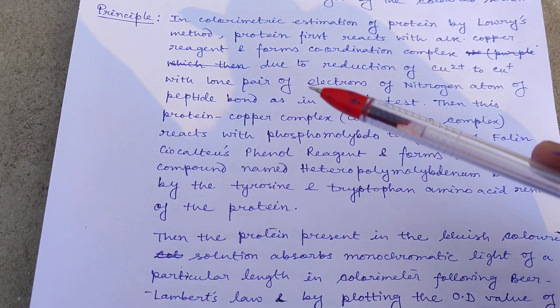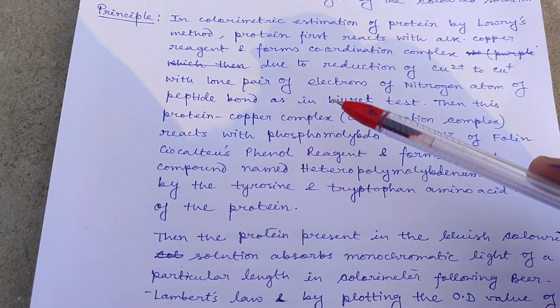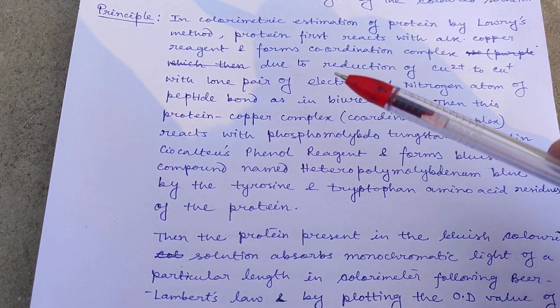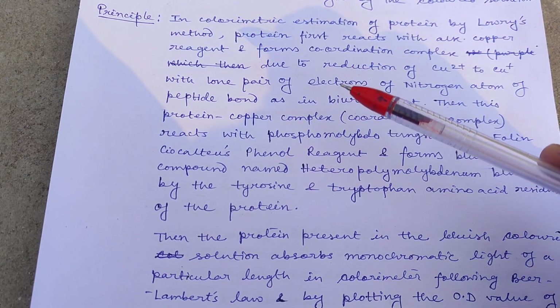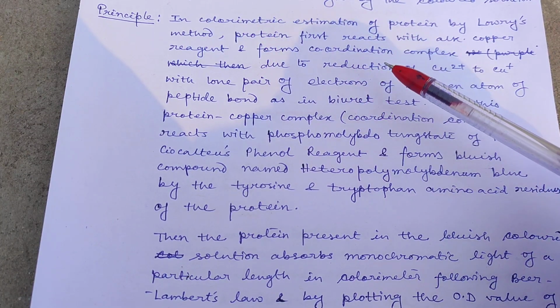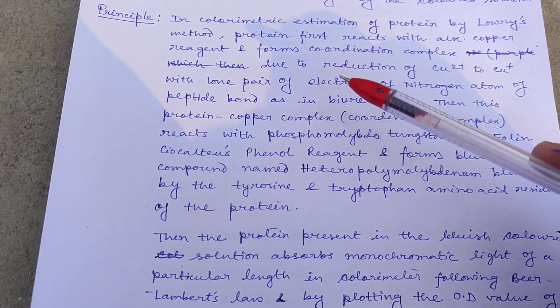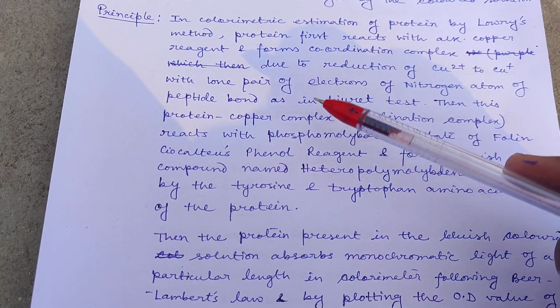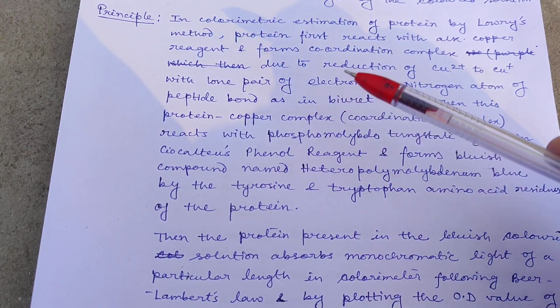So first, your protein reacts with the alkaline copper reagent. How do they react? The lone pair of electrons of the nitrogen atom of the CONH bond, that means the peptide bond, reacts with the Cu2+ ion of copper reagent. And they form a complex known as protein copper complex or coordination complex.